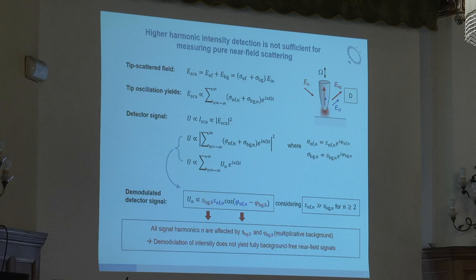And we will see in the next slide how we can solve this problem with a real reference field. The problem with this background is we don't know anything about it, and we have it barely under control because it depends on how we align the setup and so on, okay? So that's a little bit the problem. So this does not work. So don't just close your interferometer and measure.